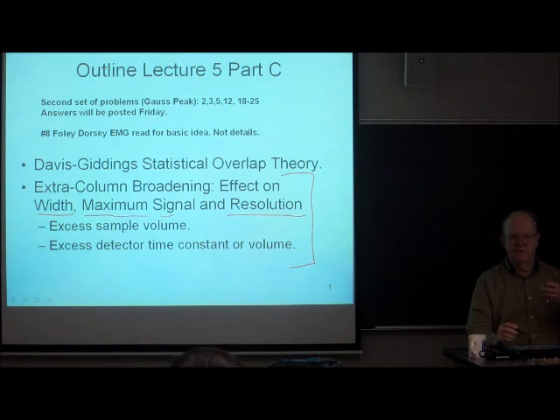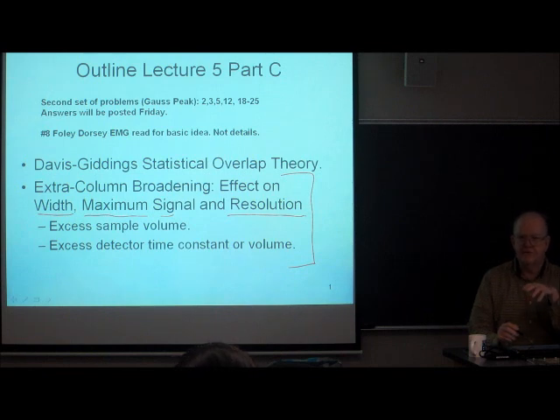If you don't set your equipment up the right way so that you minimize the effect of extra column broadening, your resolution can be very seriously degraded.